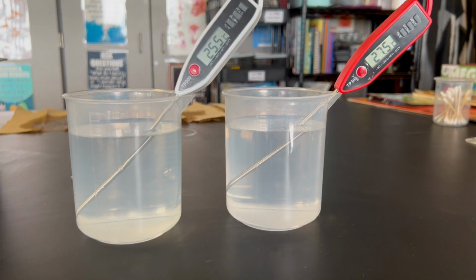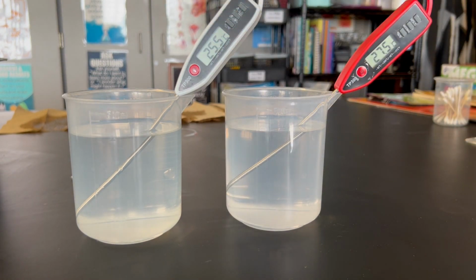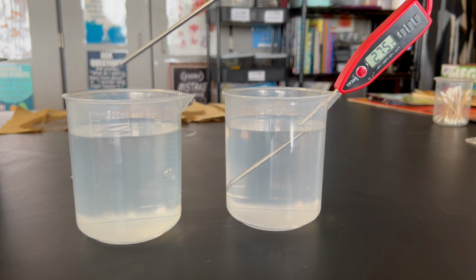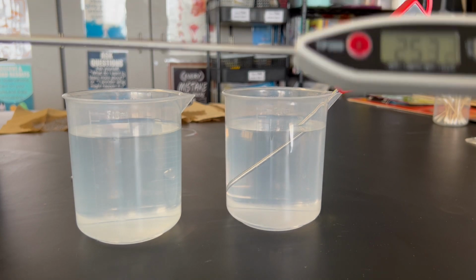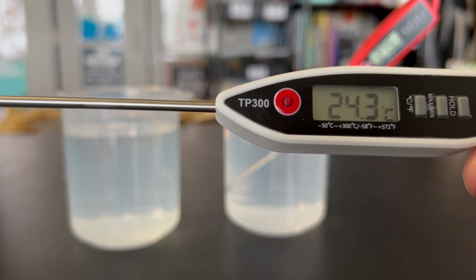All right, let's watch this demonstration. I have 2 beakers of liquid. You can see the thermometers have been sitting in order to determine the temperature of the liquid. So I'm going to start with this thermometer. I'm going to lift it out of the beaker, and then we are going to watch what happens.